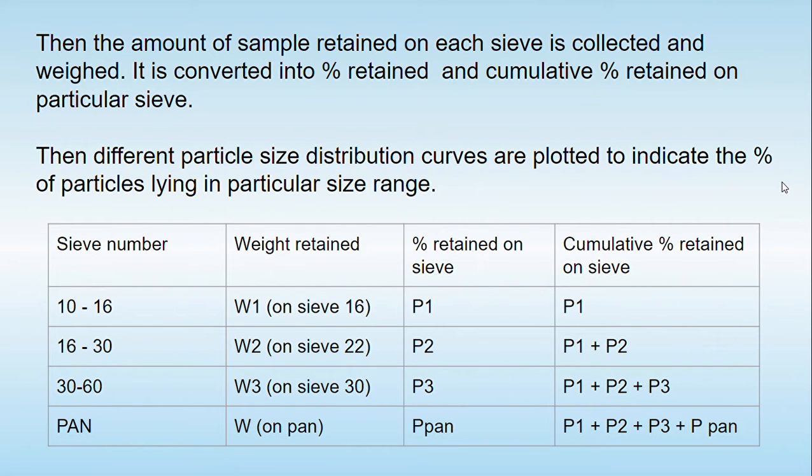The sample retained on each sieve is collected carefully and weighed. For example, let's try to understand this particular thing.